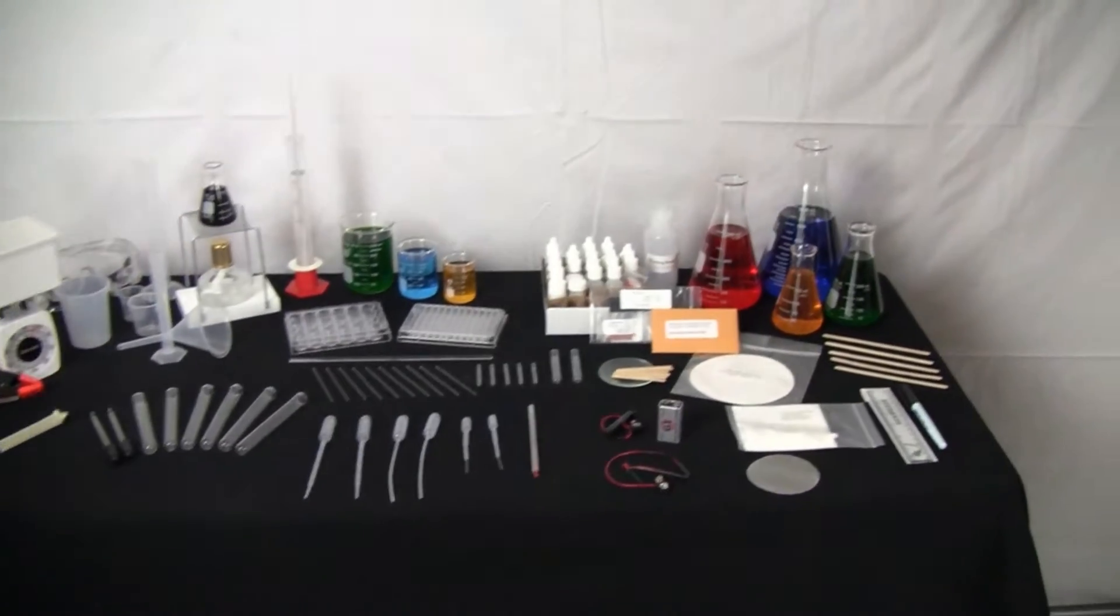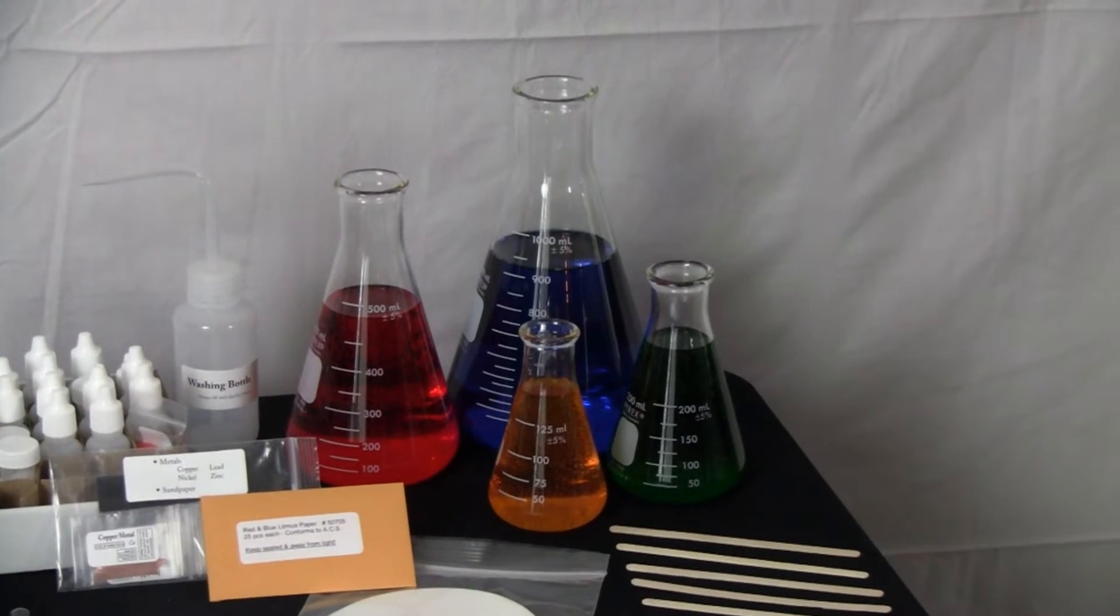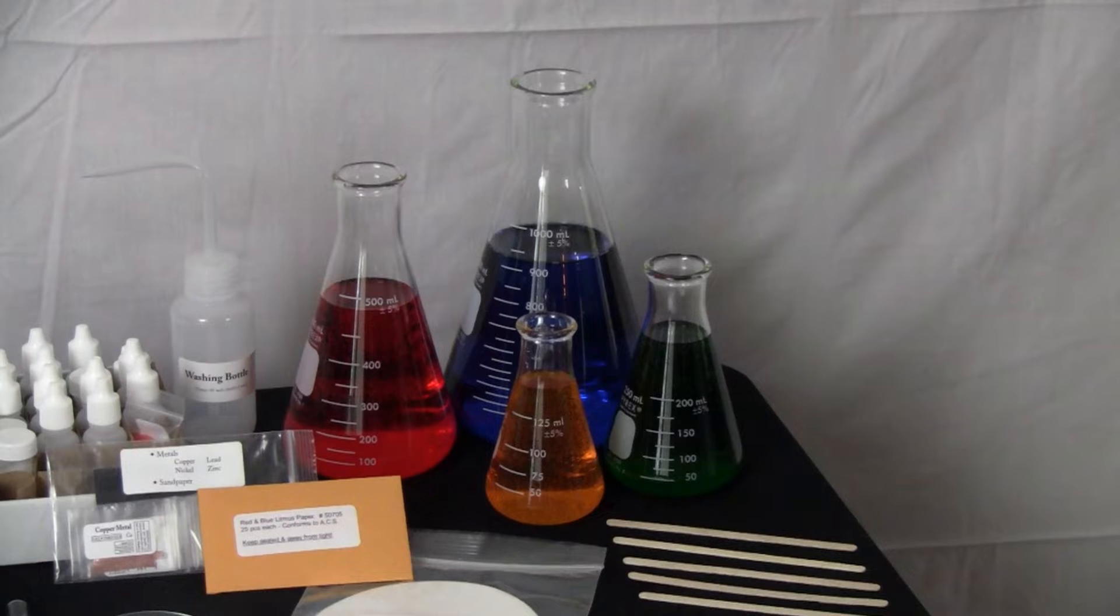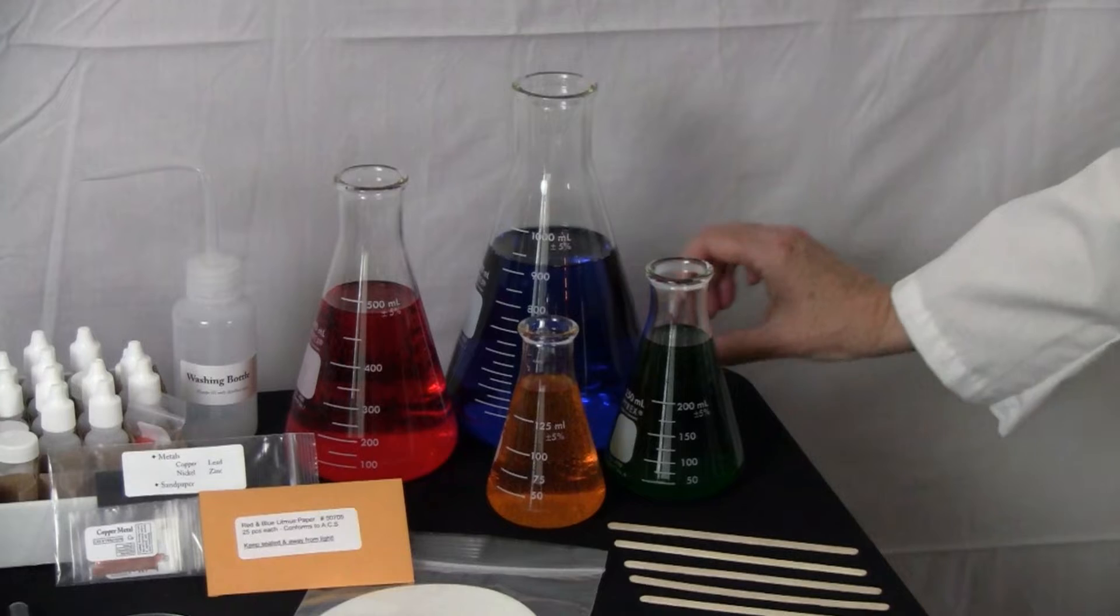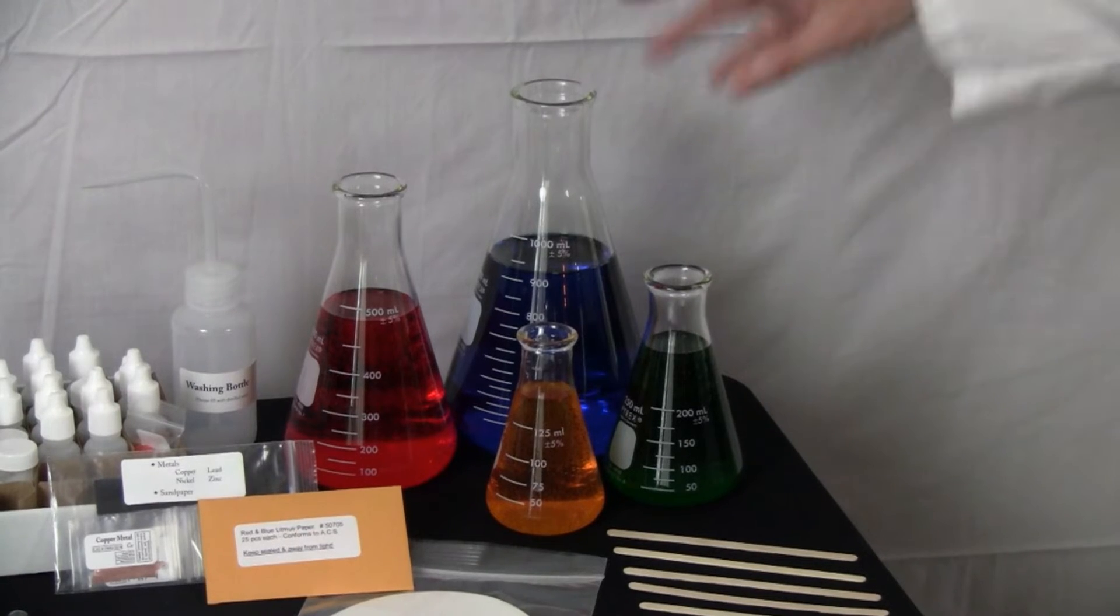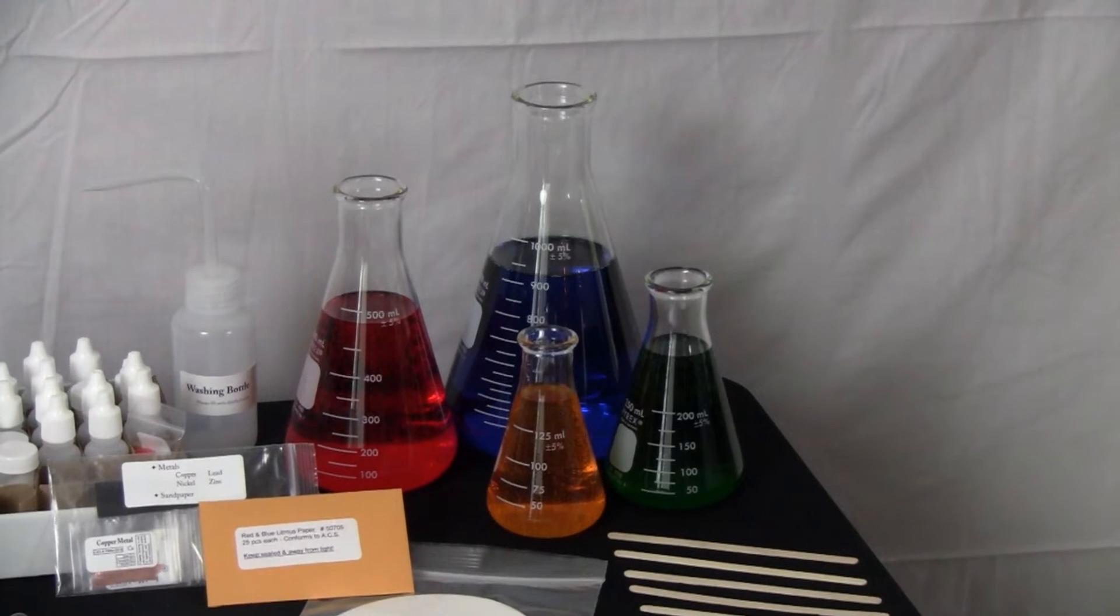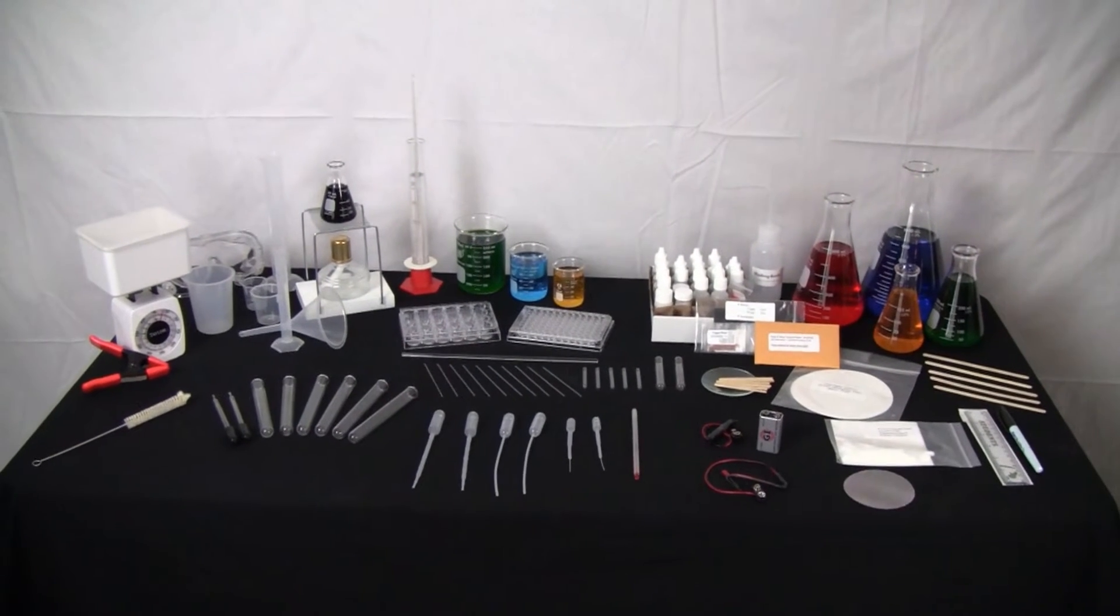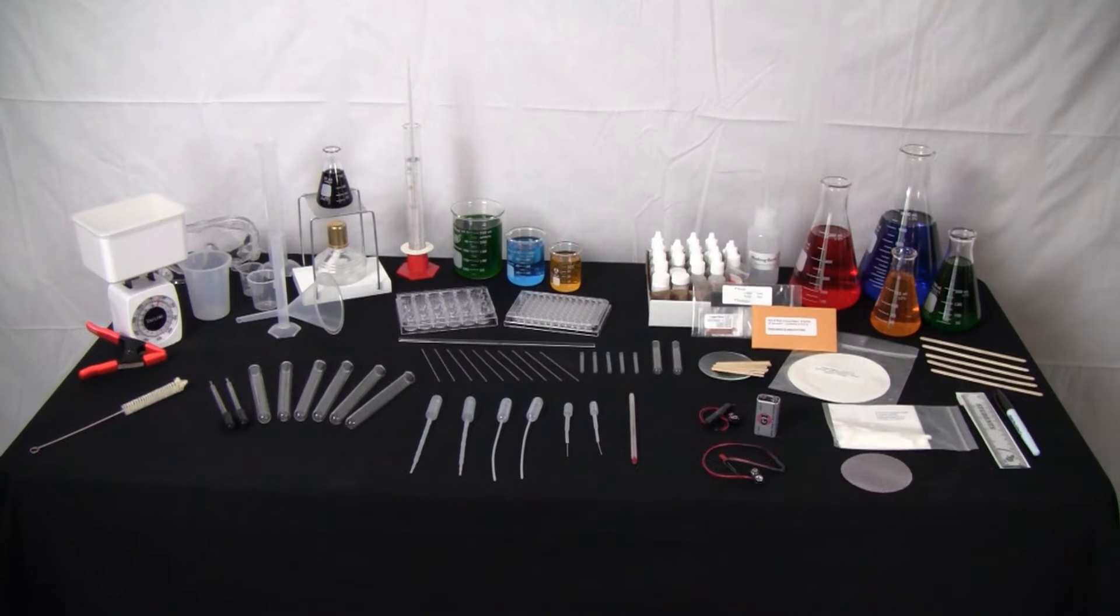First of all, we have the Erlenmeyer flasks. These flasks are so fun. They are used to collect, hold and mix chemicals, and if you get strong ones, you can actually put them on Bunsen burners and heat up liquids. These are super cool to have when you have dry ice on the bottom, and a tiny bit of water, and then it comes up out of there, and then spills out the gas of it, falls, and it looks like you are a mad scientist. So the Erlenmeyer flasks are super fun to have, and they measure, you can measure the liquids on the side of each of the Erlenmeyer flasks.